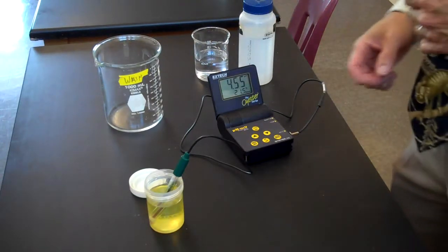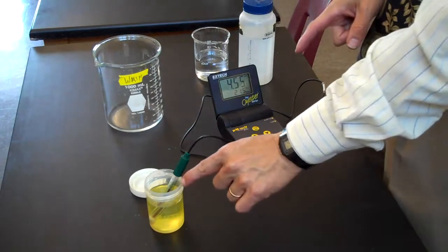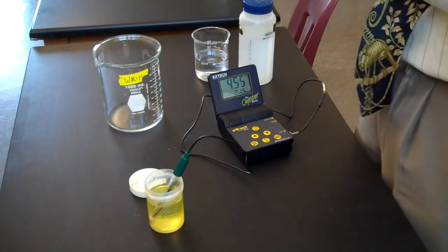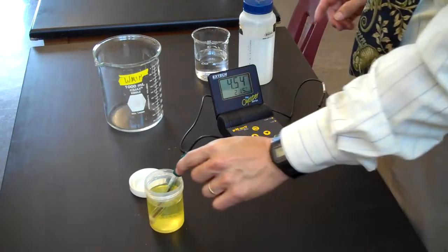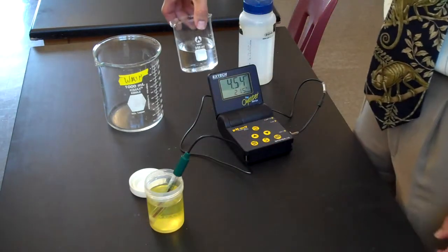When you go to use the pH meter it will probably look like this. The electrode is resting in a buffer of pH 4 and the solution you'll bring is in a beaker like so.